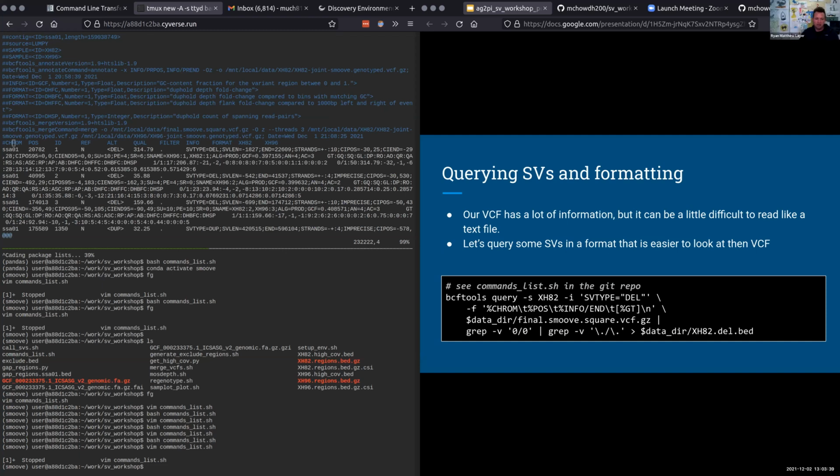I know we're kind of trudging through this a lot. Ideally, the worksheet, which I will paste the link to again, give me 1 second. We're following this. All the steps that Murad has are in this Google Doc that we are updating live. So if there's errors, please let us know. But yeah, let's just hang out for 5 minutes and let people go to the bathroom, catch up, or ask questions. Definitely ask me questions, because I feel like sometimes I might gloss over something that is obvious to me but not obvious to others. And if something is even slightly non-obvious, just feel free to ask.